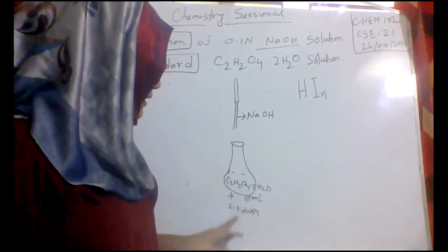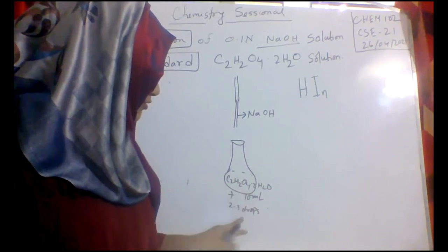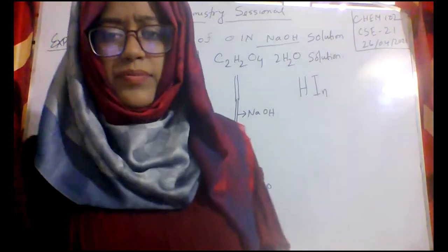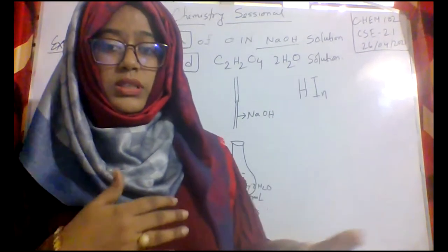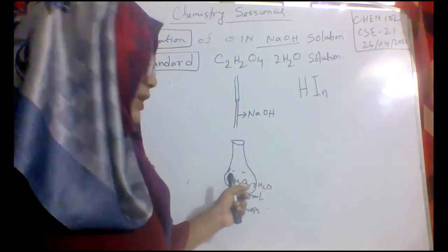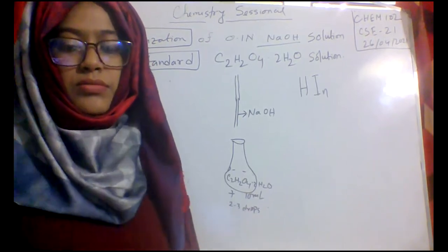So in this case, we have oxalic acid and phenolphthalein indicator. But when we are adding the sodium hydroxide, why doesn't phenolphthalein dissociate first? Why is the oxalic acid neutralized first?